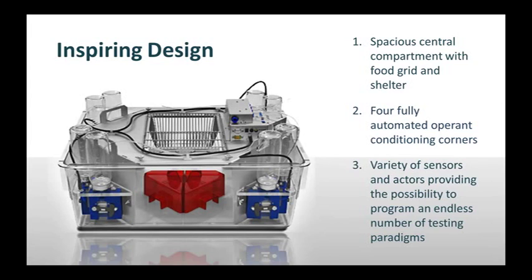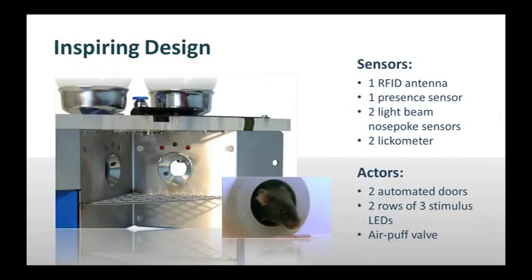Illumination and temperature sensors also control the test environment. The sensors in the system monitor the behavior of the animals. The actors perform the hardware events that shape the response of the animals according to the behavioral paradigm.